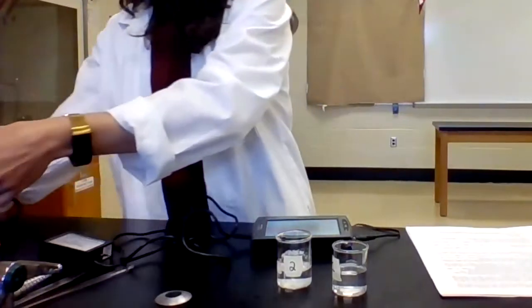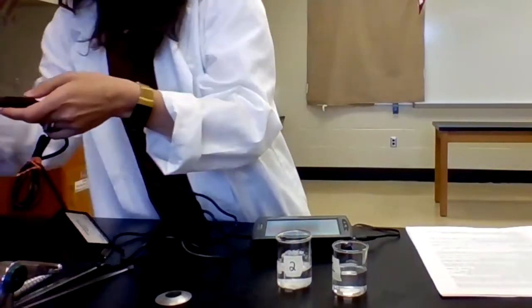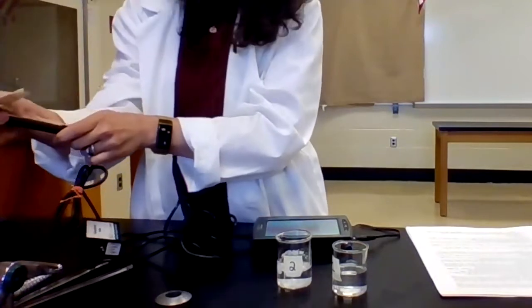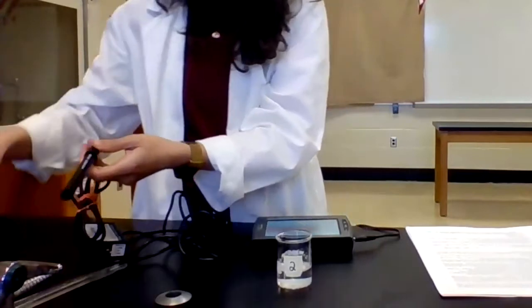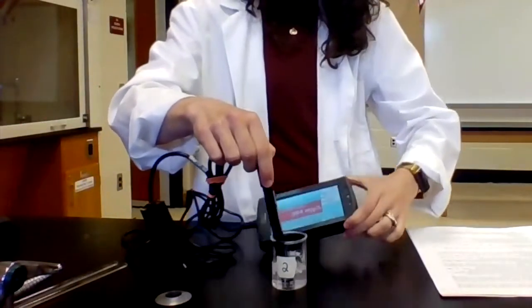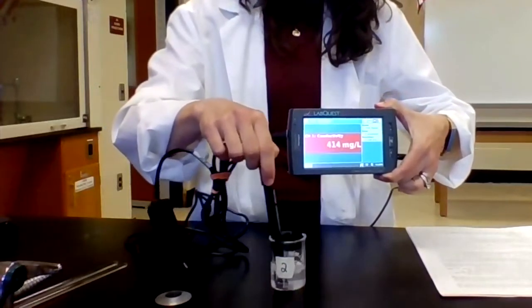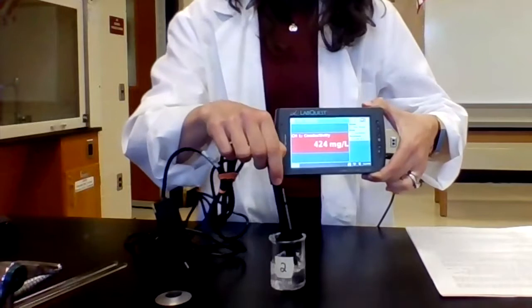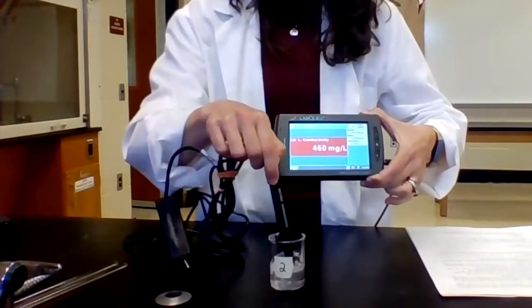Right. Now I want to rinse this probe, and I want to try solid 2. Now we can see that solid 2 does have a little bit of conductivity, but it's nowhere near what solid 1 was. So this is reading around 450.